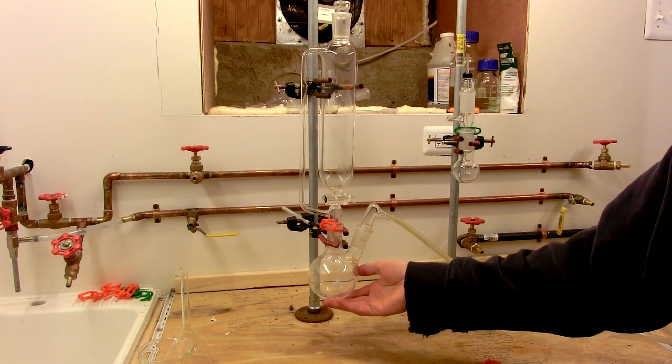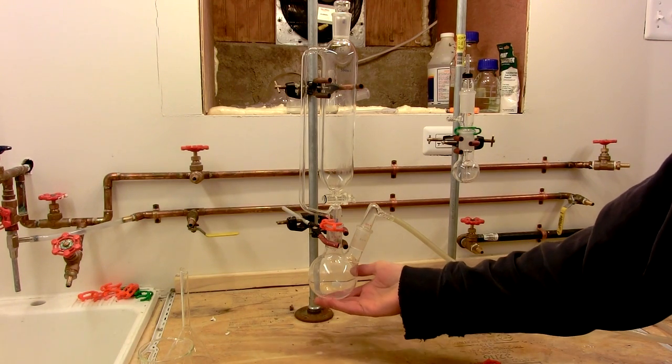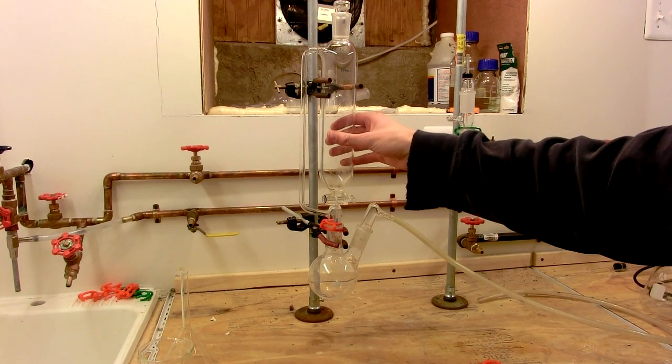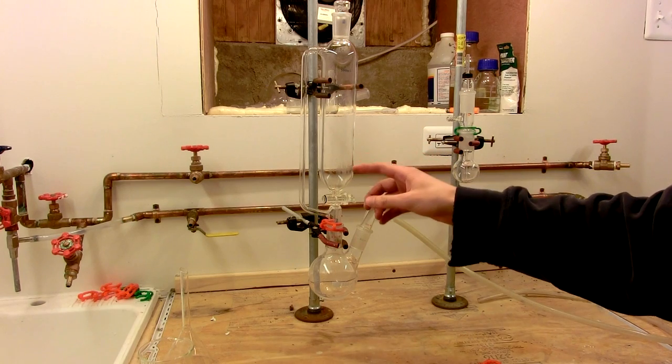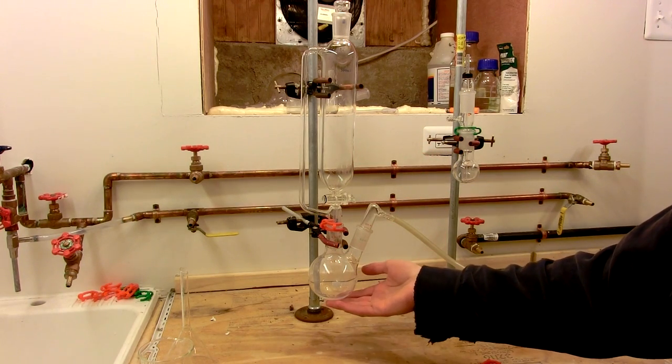The solid chlorine generant typically sits in the flask down here, and the hydrochloric acid sits up here in the addition funnel. By turning the stopcock, the hydrochloric acid is allowed to fall onto the generant, which generates chlorine gas.